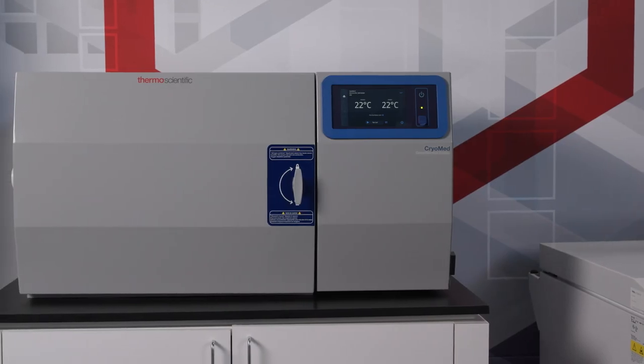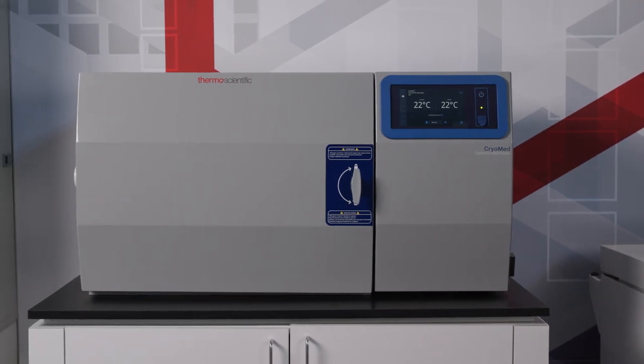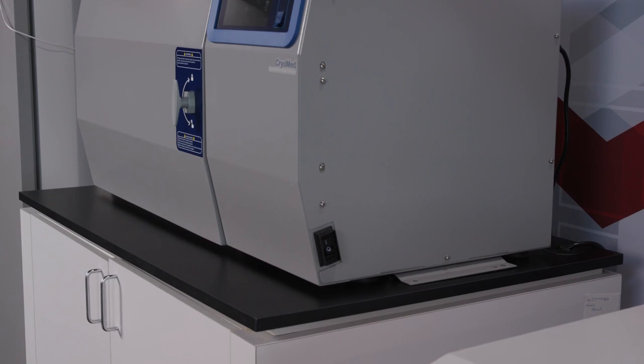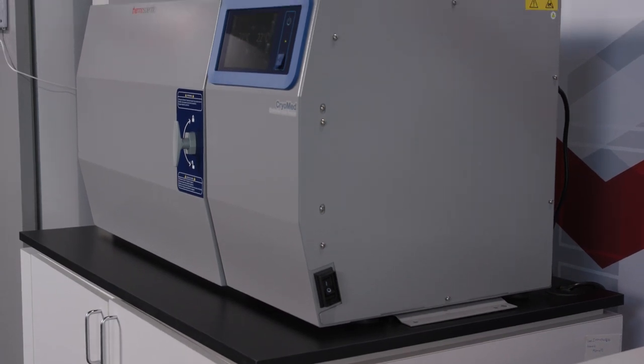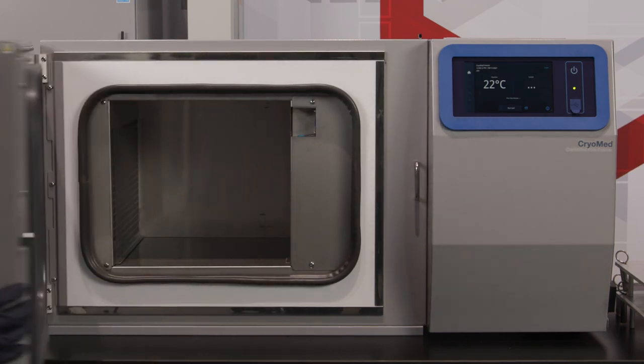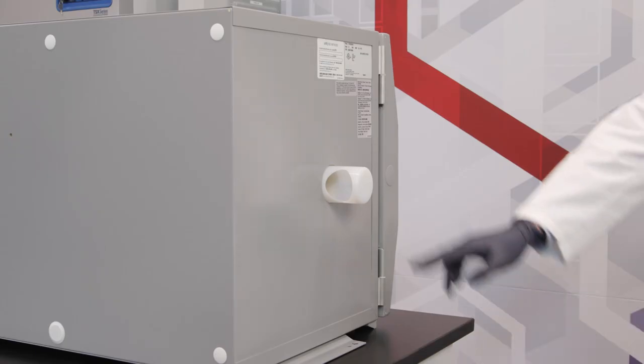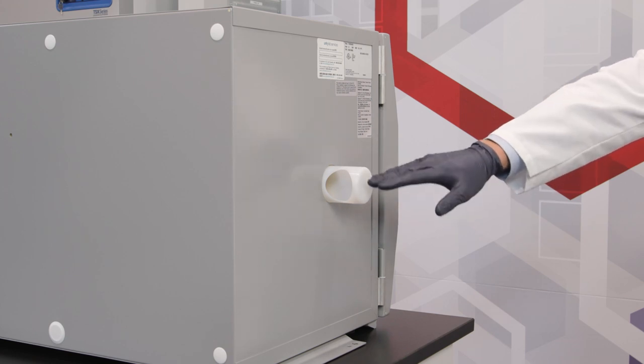Your Cryomed unit should be located in a well-ventilated area of the laboratory. Place the unit on a table or bench which is capable of supporting the unit's weight. Allow clearance for the door on the front of the unit, for the hose and power connections on the back of the unit, and the exhaust vent on the left side of the unit.